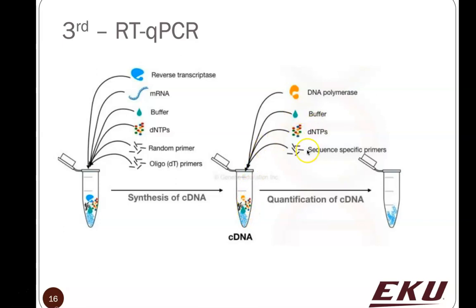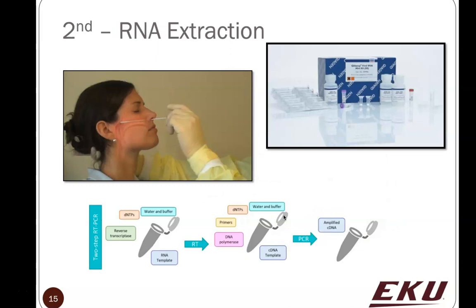It has to have the buffer. And in order for us to make the copies, just like a zipper on a jacket, you have to have the zipper lined up before the actual zipper can run. So we have to have the primers for us to line up the DNA with a place where we know we can make copies, and then the polymerase can make the copies. And when we make all the copies, it amplifies and makes lots and lots and lots of copies of DNA in our solution. This doesn't happen just automatically.